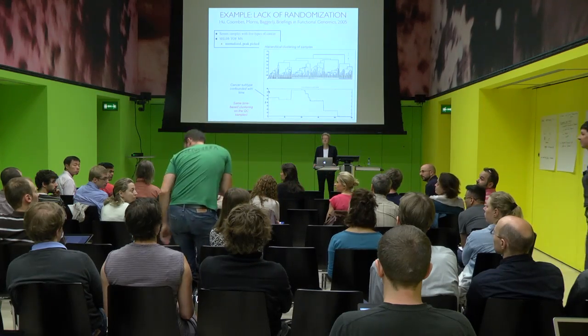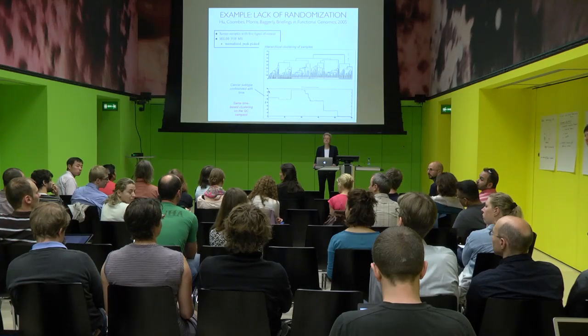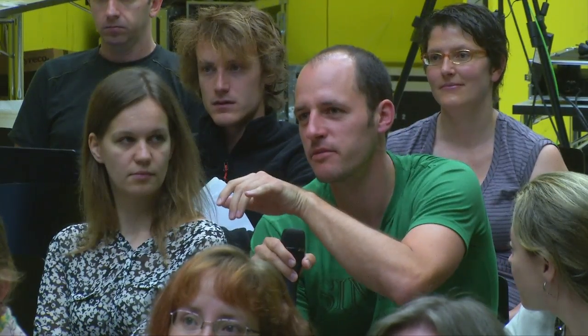So when I talk to people who pool the samples, the counter argument is, well, then I need to do less washing, because then I have only carryover within my healthy and carryover within my disease. So I group all the healthy together, all the disease together, and then I don't have carryover from healthy to disease, and I have fewer washes.